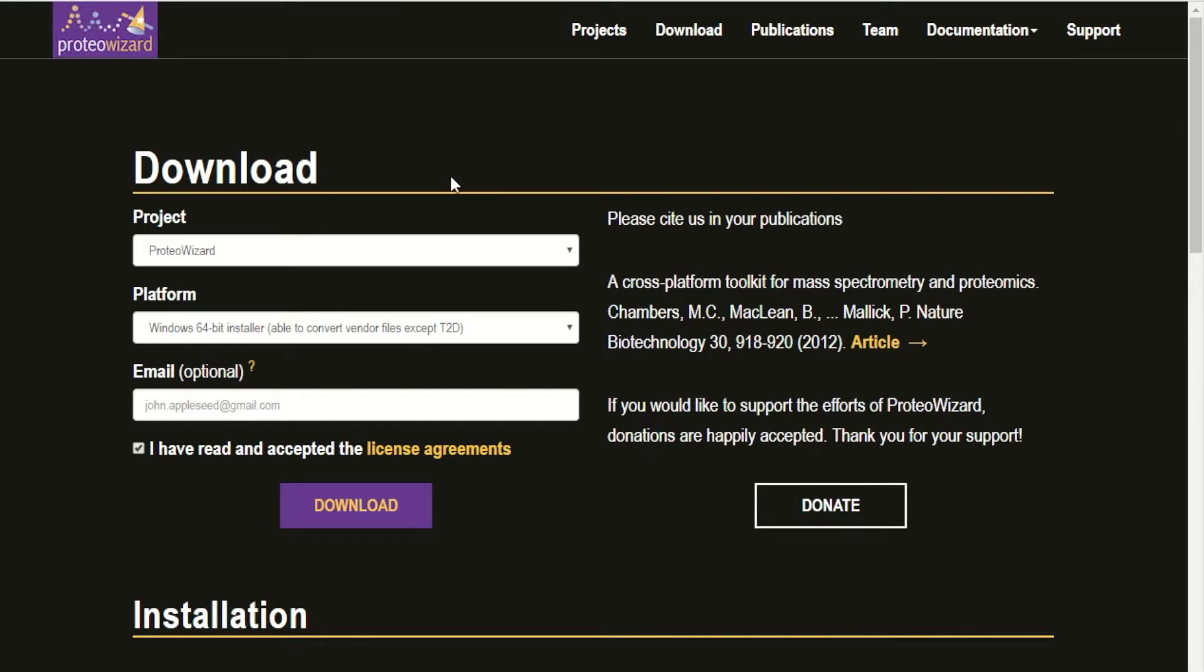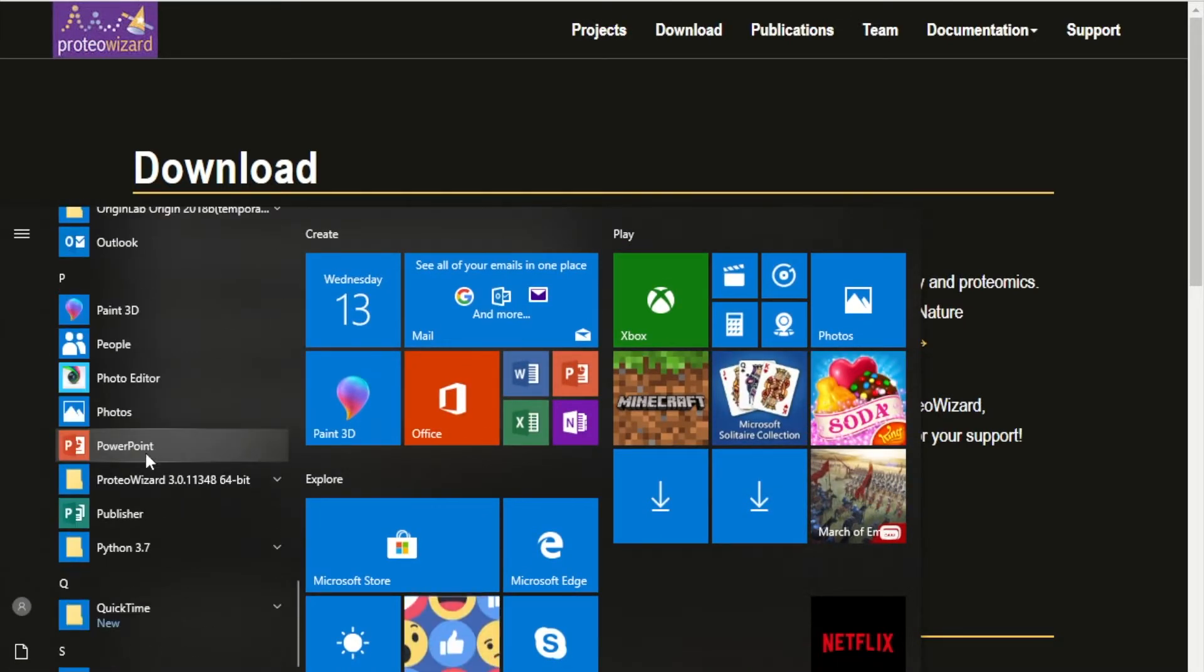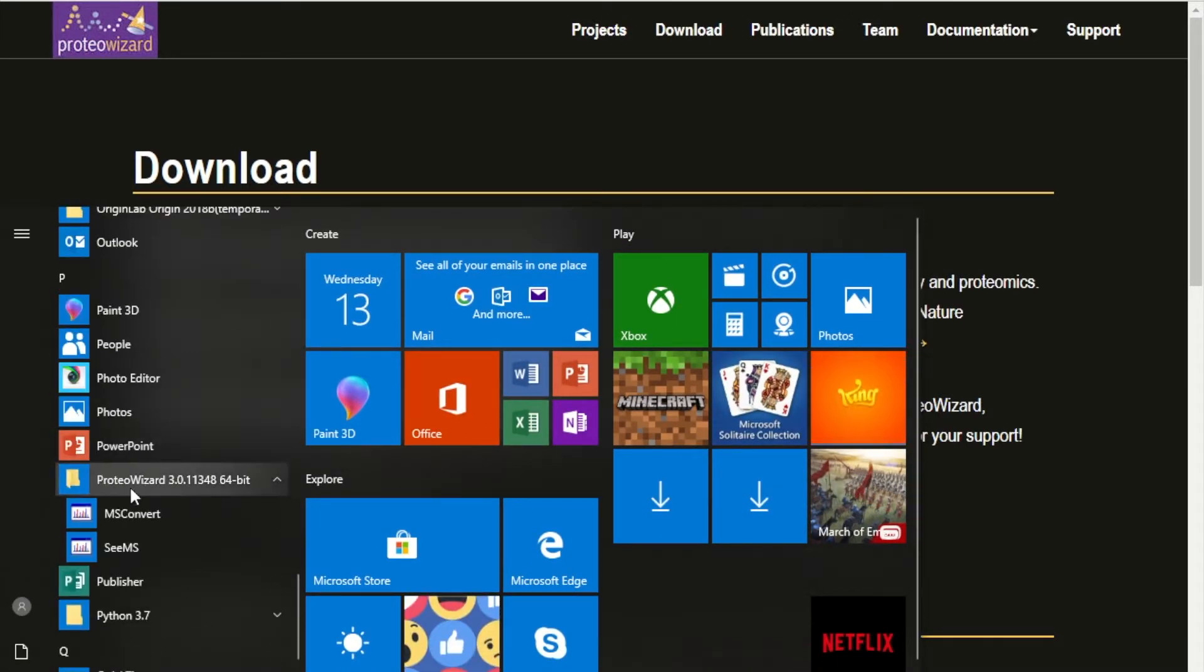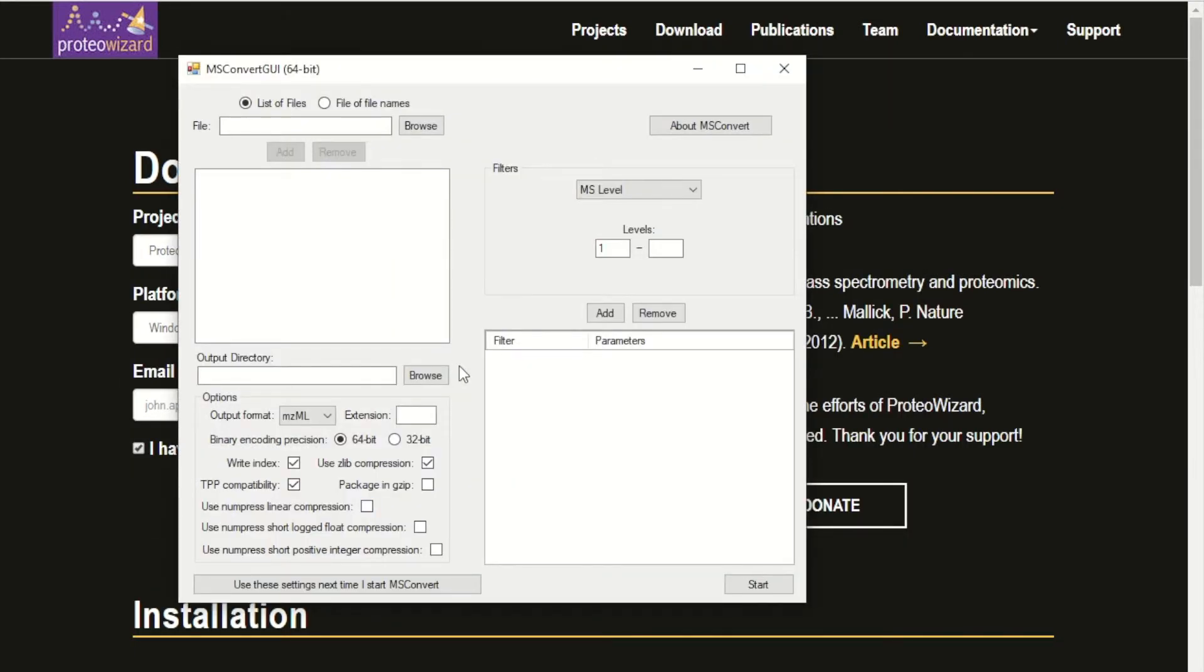The installing process is straightforward. I've already previously downloaded ProteoWizard. Next, you want to open up msconvert.